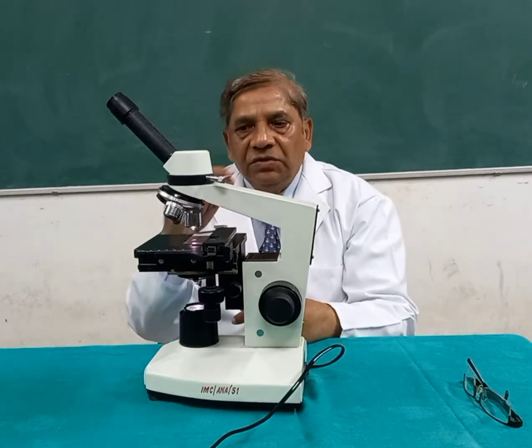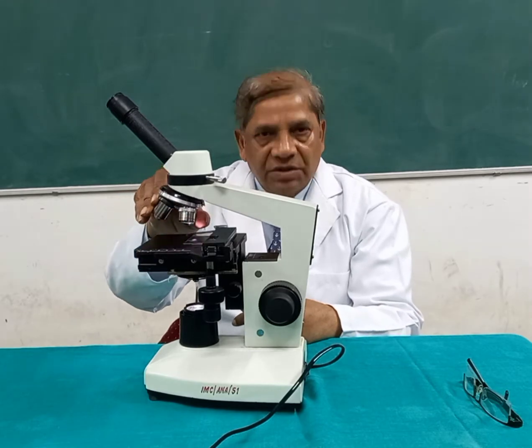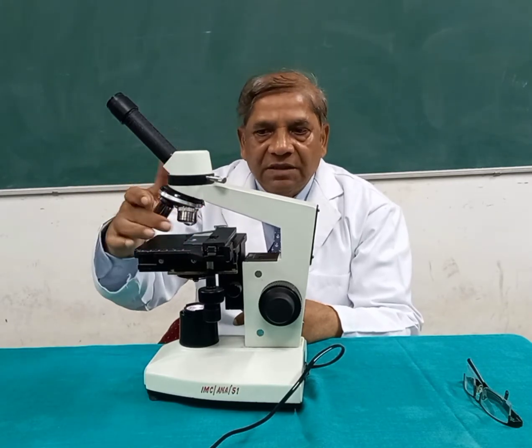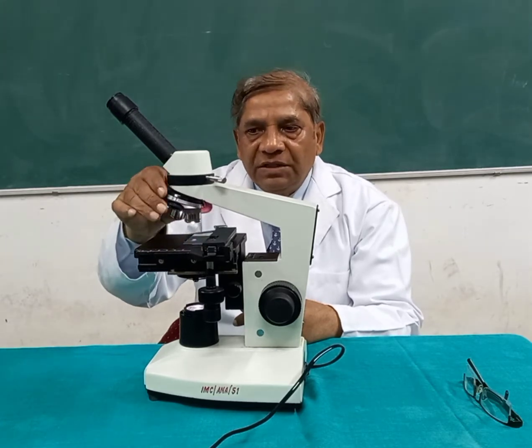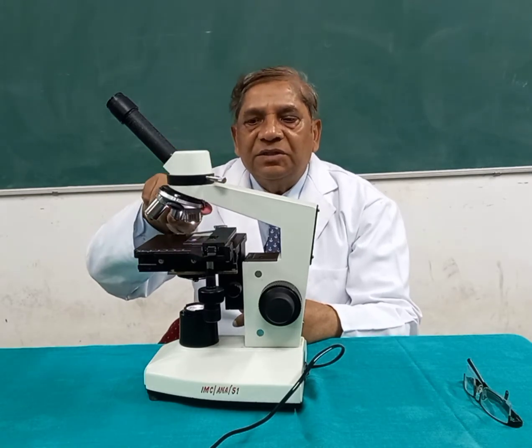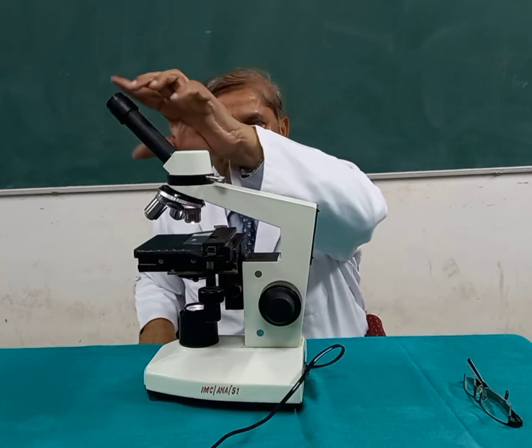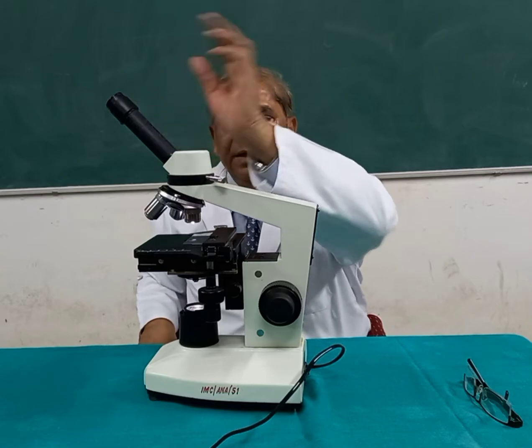And then, this is the nose piece where the objective lenses are fitted. Then you bring the smallest lens, that is the 4x lens, which is also called the screening lens, and rotate this nose piece till there is a click sound, and then this smallest lens will be fitted here. Then you try to see the image with the help of this eyepiece, which is fitted on the top of the eyepiece tube.